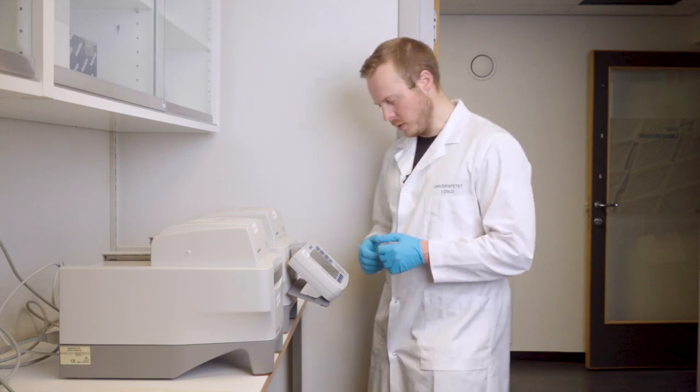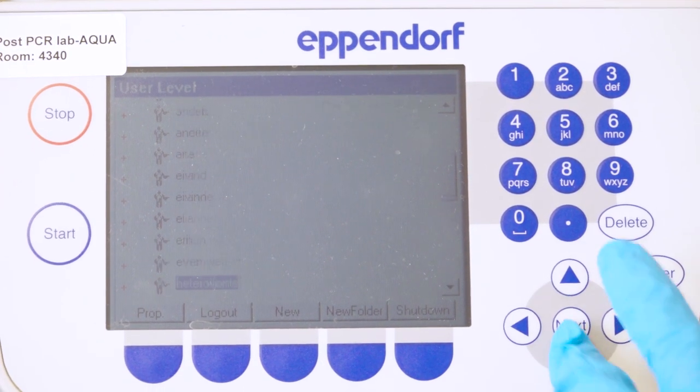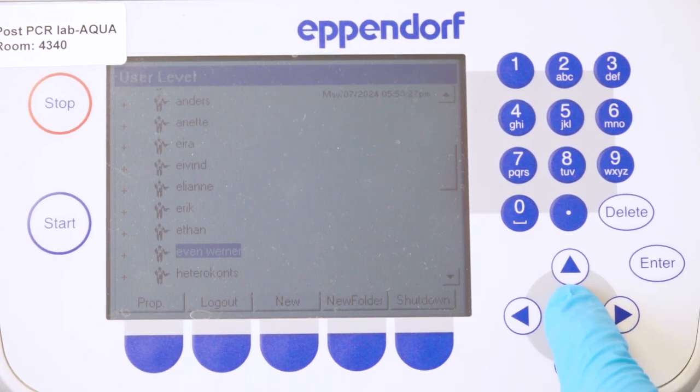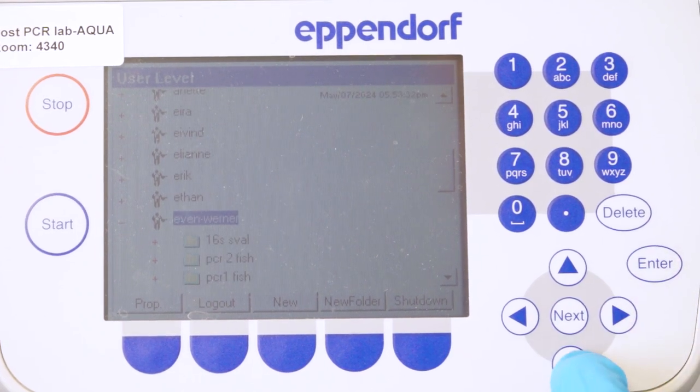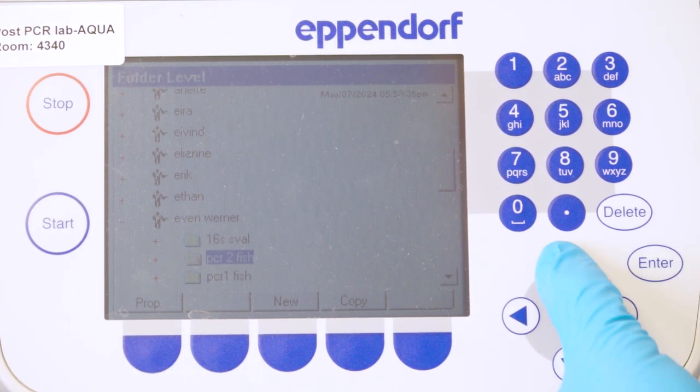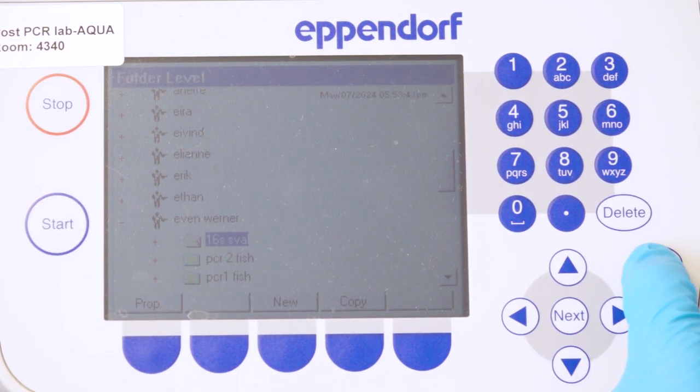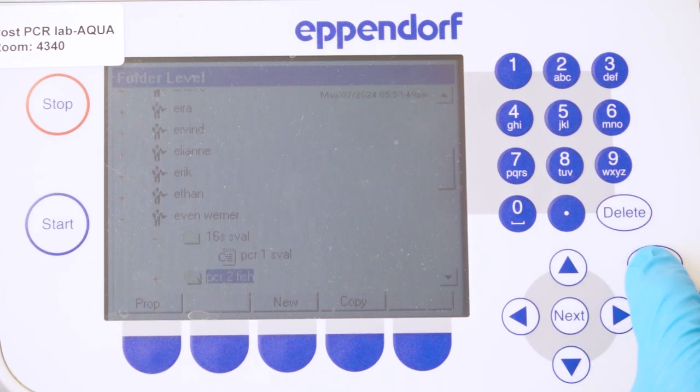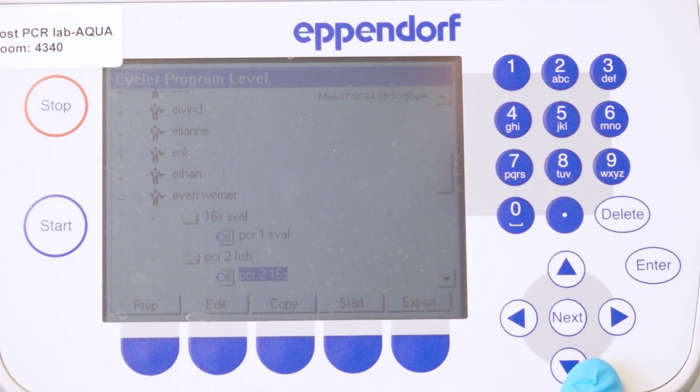I have logged into my user. Here I can select different users. Since I'm logged into my own user, I need to click on that user there with the enter button. Then I see that I have different folders I can go into. 16S is for the bacteria. I didn't have the right program in this folder, but I have another folder with PCR2, and here I have PCR2 for 16S.